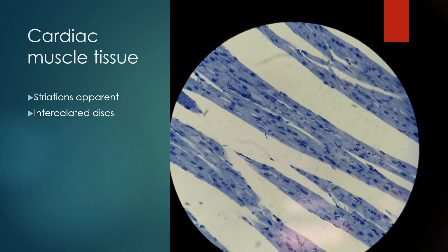Number seven was cardiac muscle tissue. What you're going to look for is striations. This picture didn't turn out quite as well as the skeletal muscle, but there were striations apparent in this tissue—those very faint little lines. The other thing you'll see with cardiac muscle tissue are those intercalated discs. I'm going to circle one here—that line, that is an intercalated disc.